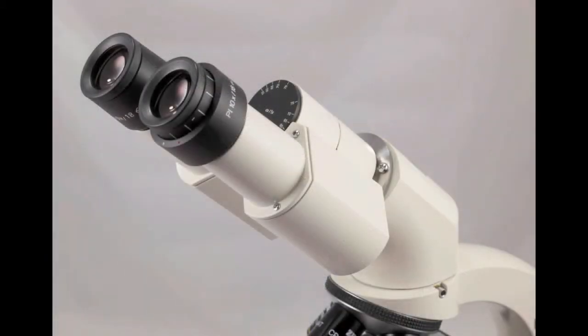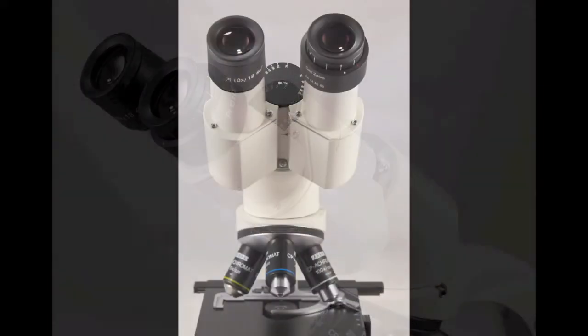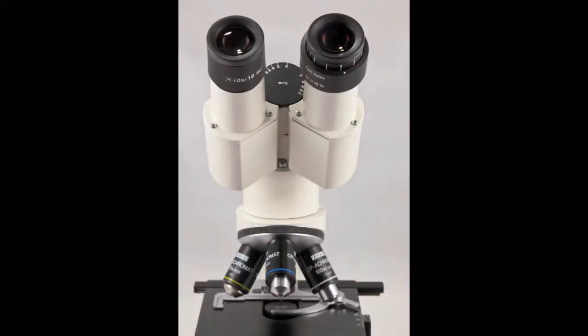The KF2 is a binocular microscope with two eyepieces. You can adjust the width of the eyepieces by grasping the binocular tubes and twisting them up or down, similar to the procedure with binoculars.